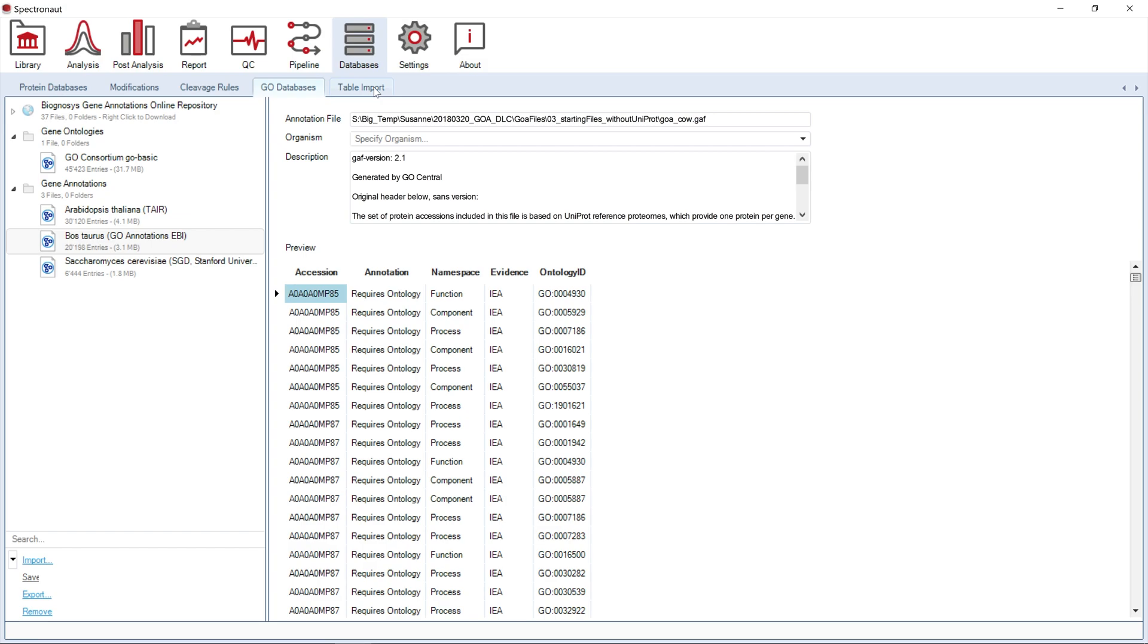Once you import a new library format into Spectronaut, it will ask you whether it should store novel synonyms for column headers, which will be helpful for future uploads.